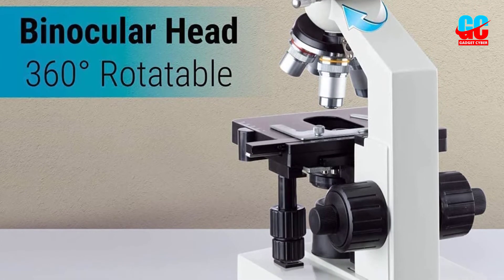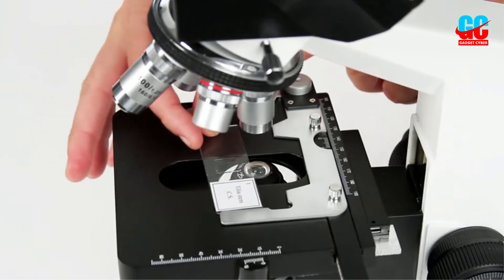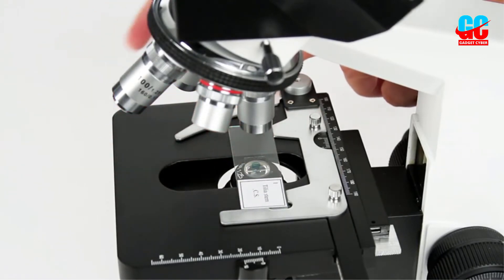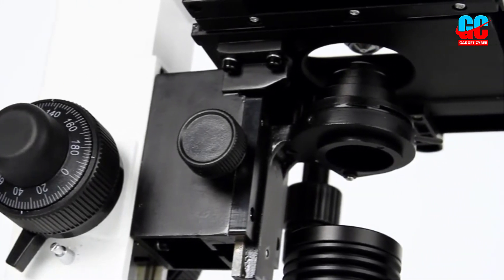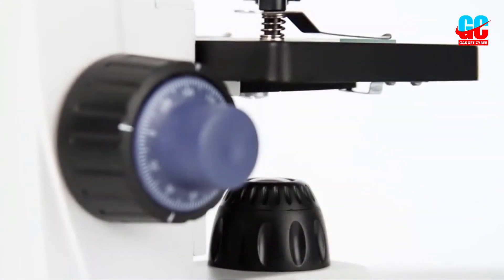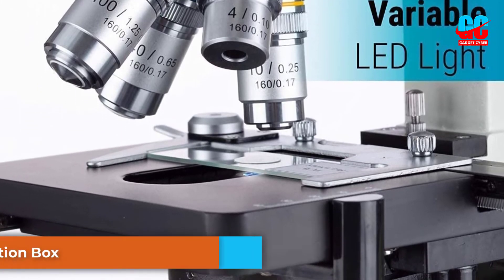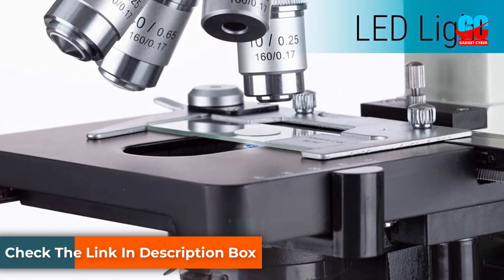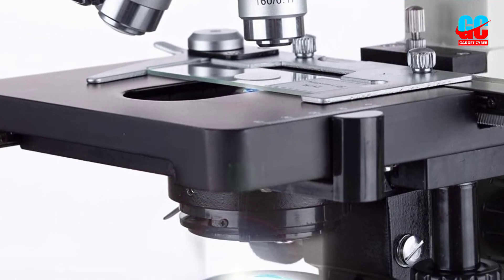We appreciated the diversity of this, but the range wasn't as great as hoped since the highest level of magnification offered is 2000x. This is still better than many competitors, but not as high as the 2500x offered by the Swift SW380T. This microscope is a little bit cheaper, but it's still on the expensive side. The separate coarse and fine adjustment knobs made it easy to dial in the proper focus.